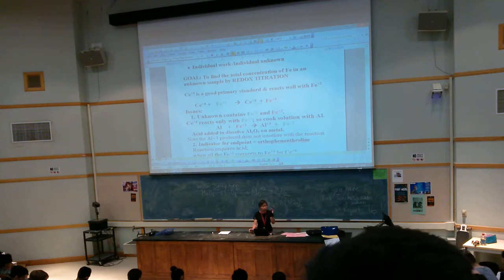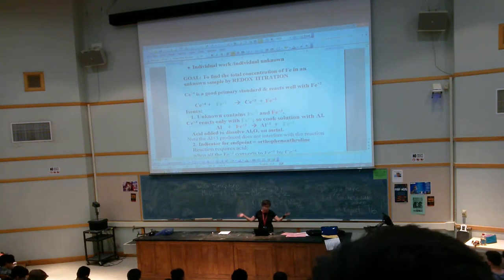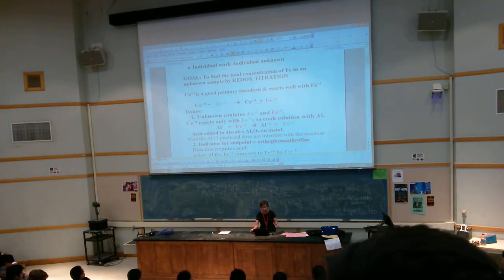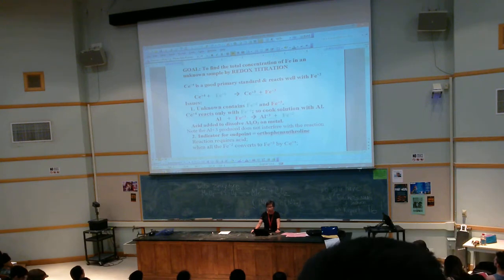Your procedure tells you when you have acid. I think both of you are going to have acid. So wear your awful clothes. If you get some on you and you have holes in your clothes, it's okay. All right? The indicator or endpoint is orthophenanthroline.